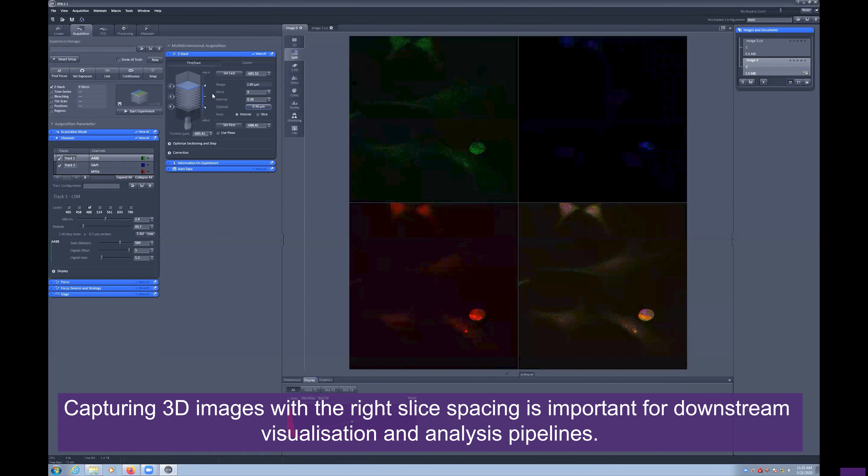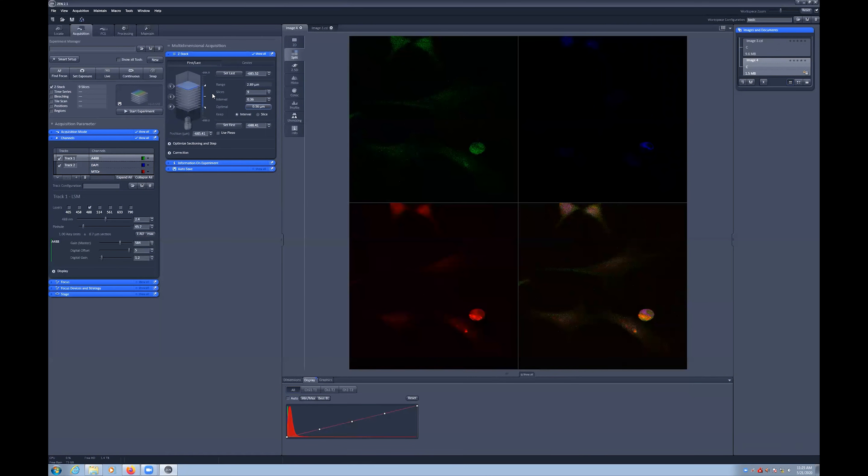For this example, we have 9 slices spaced 360 nm apart, covering a range of just under 3 microns.